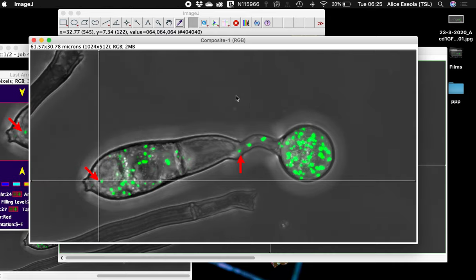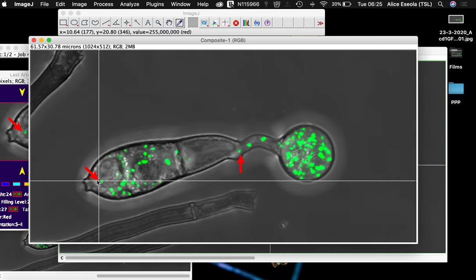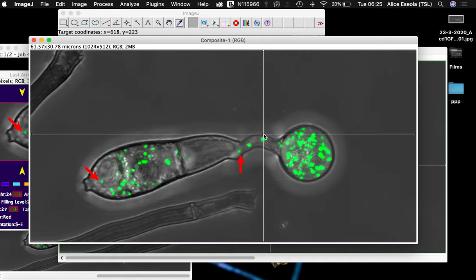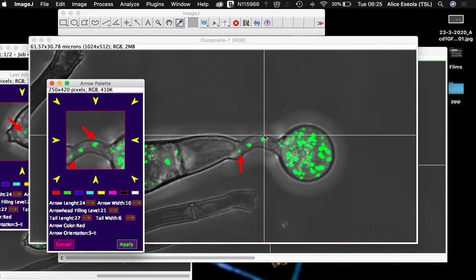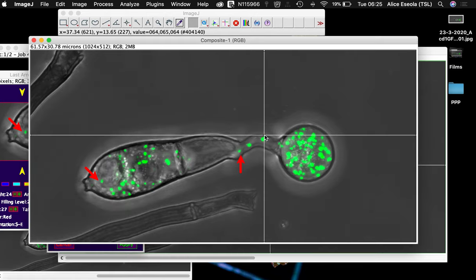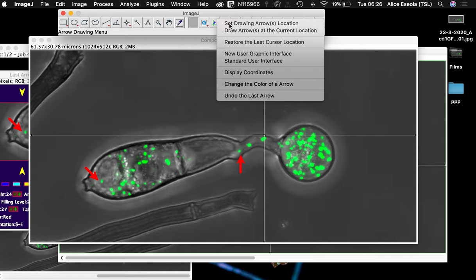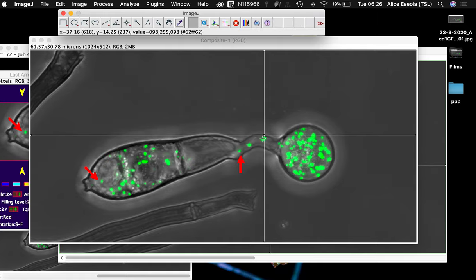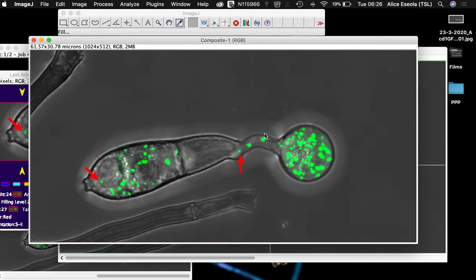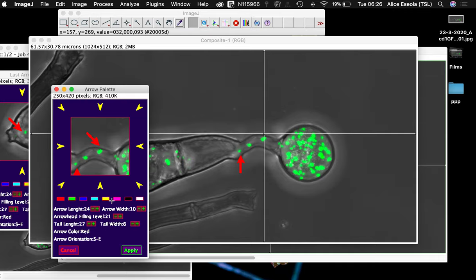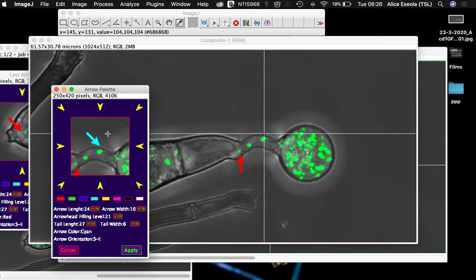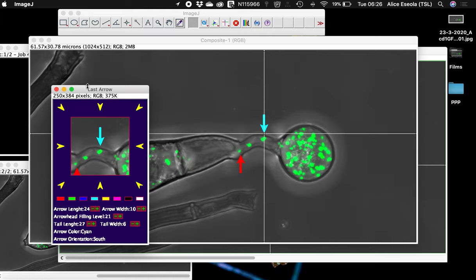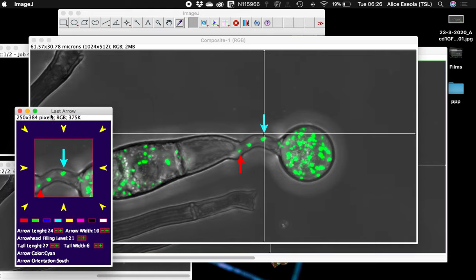Now we want to click on something bigger than the sizes that we have before. We can just drag our navigation tool and select the arrow drawing location. Because I might want to talk about these bigger objects with a different explanation, I'm going to select a cyan color and let it point from the top.